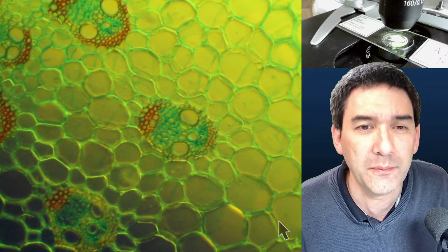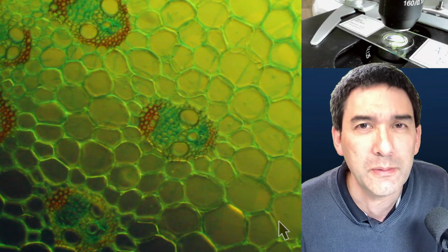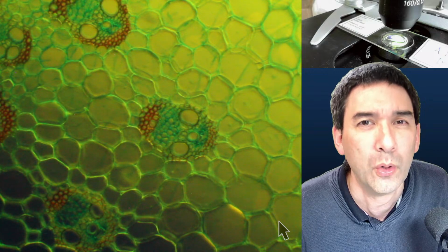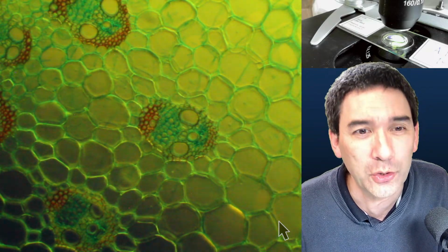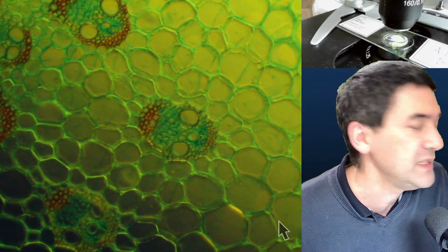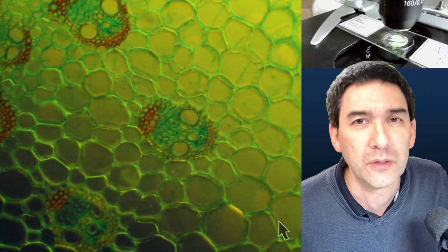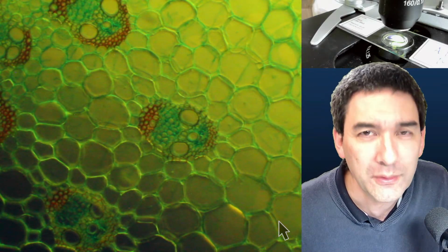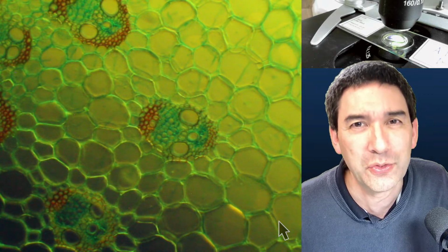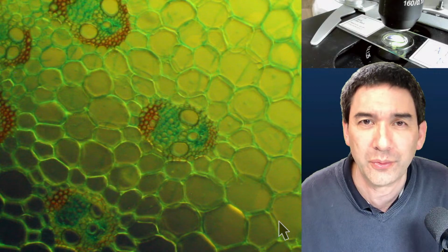If the specimen is very transparent, then it will appear more like dark field, where the specimen is brighter on a darker background. I have not tried this yet with all of the specimens, but generally, if the specimen is too transparent, then you're also not able to see quite a lot, because most of the light will go through.